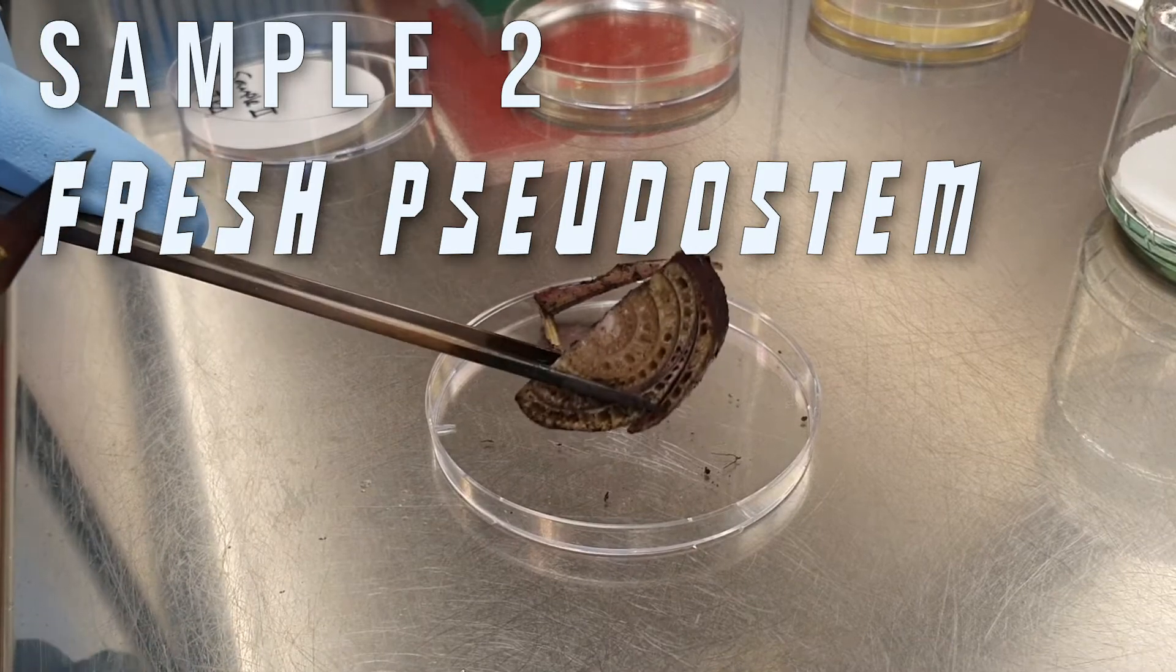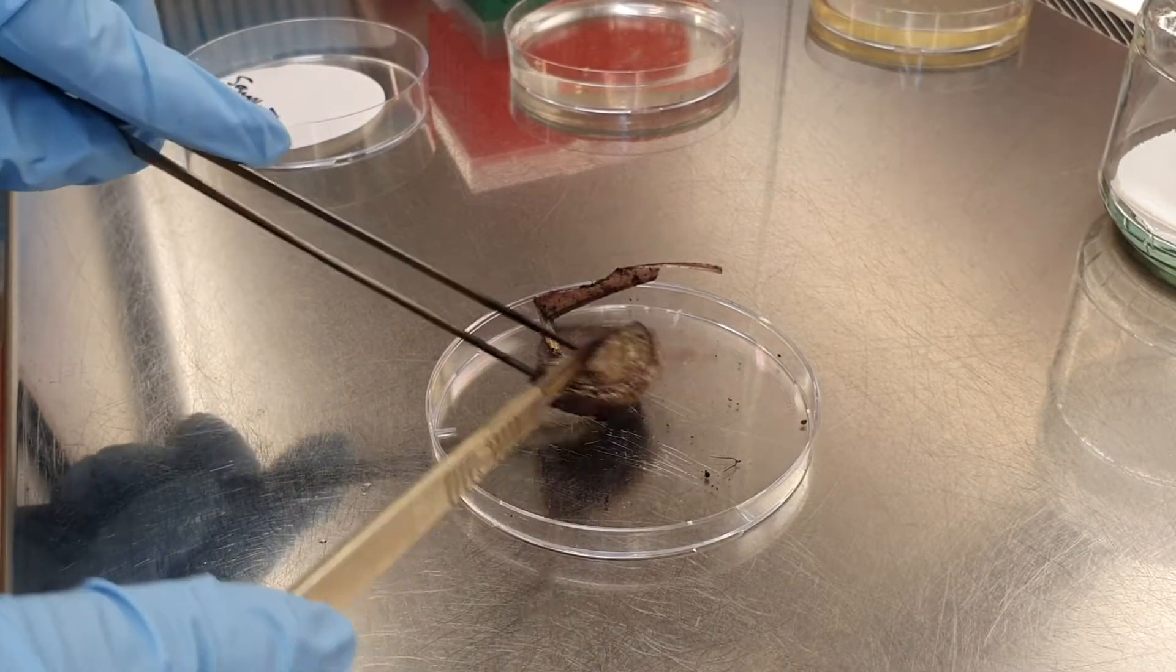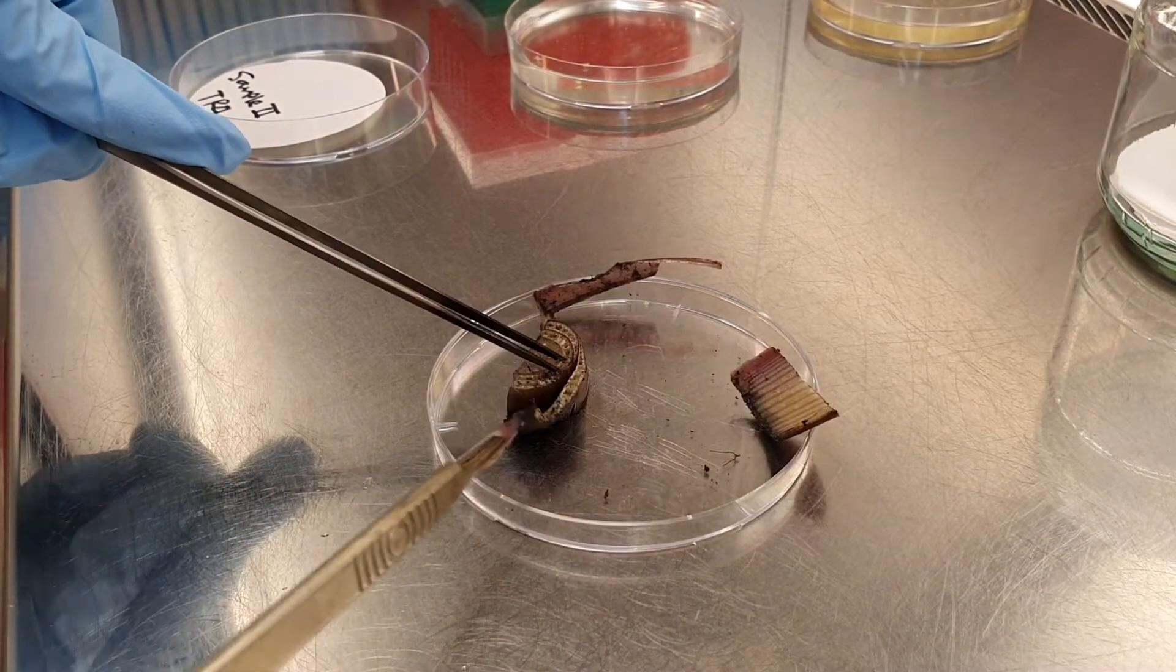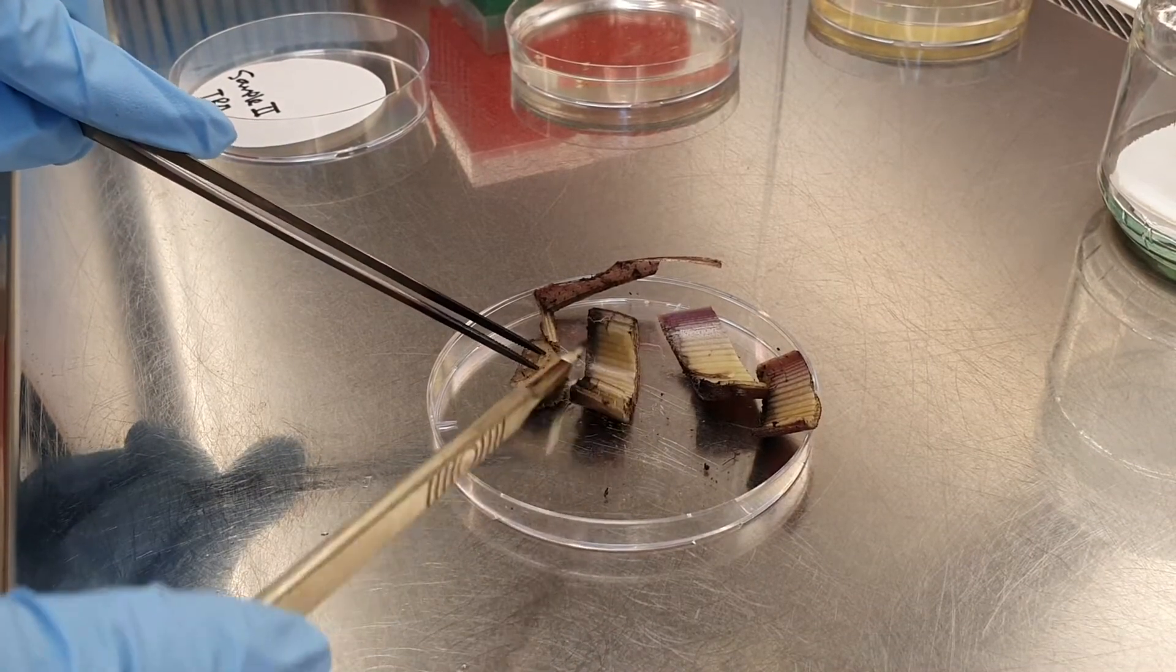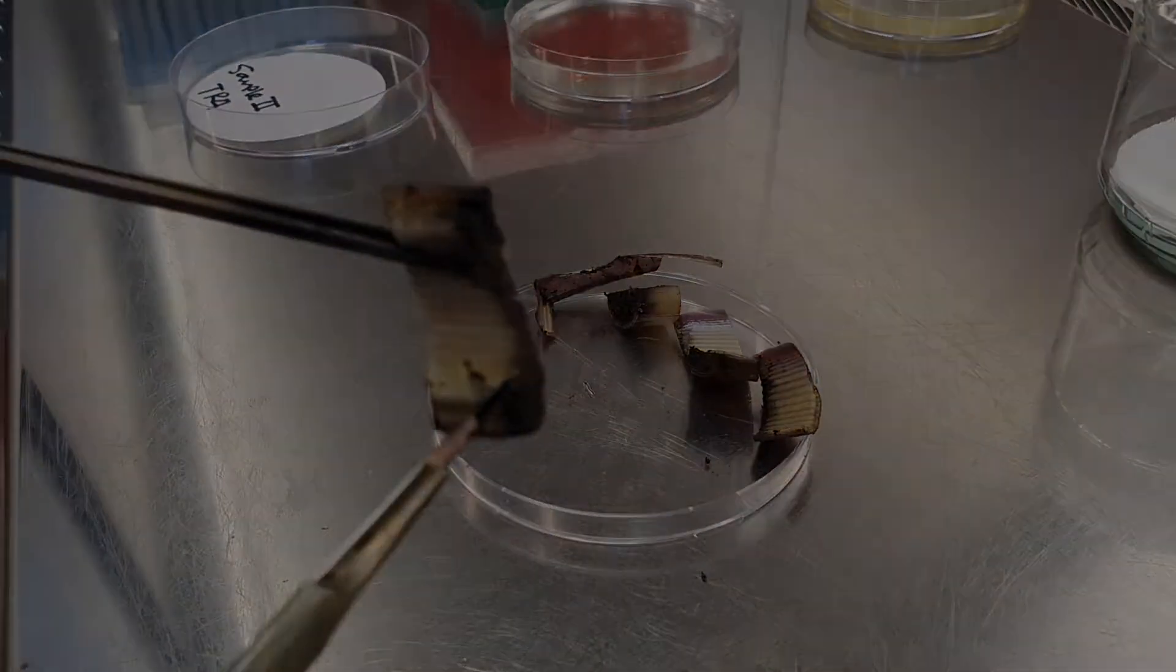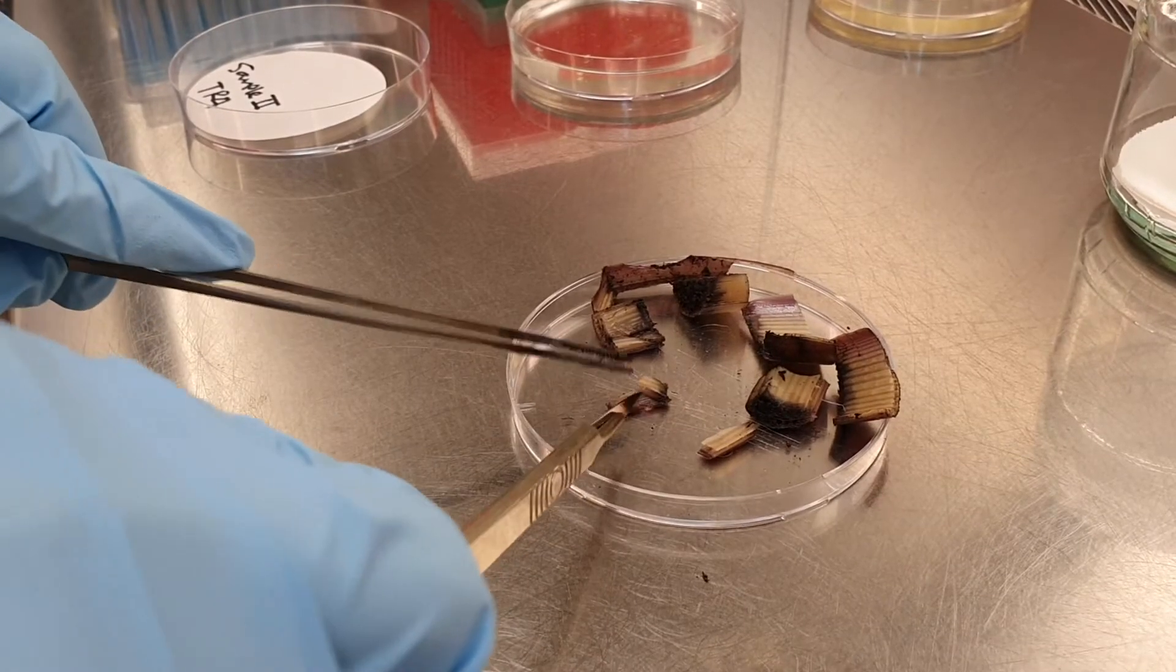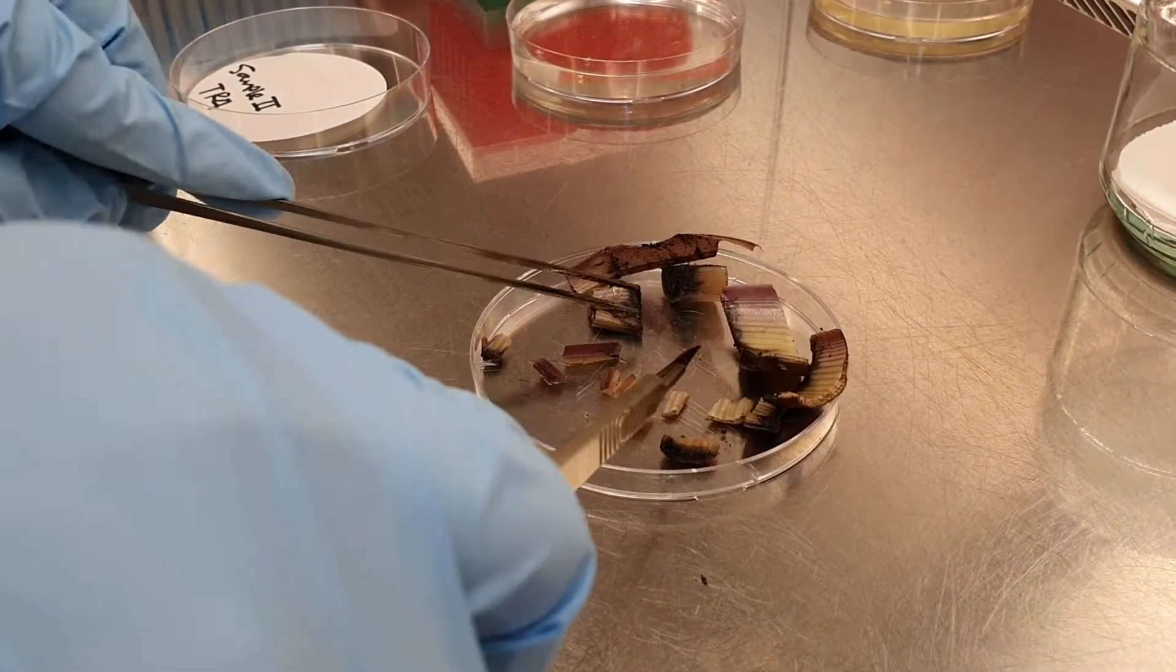Sample number two, seldo stem. For this type of sample, what you need to do is get rid of the first layers. So we are going to eliminate the first, the second, and we are going to focus on the third and fourth layer like this. And we are going to repeat the same process. Just cut very small pieces depending on the number of plates. But I recommend you to put five pieces per plate.